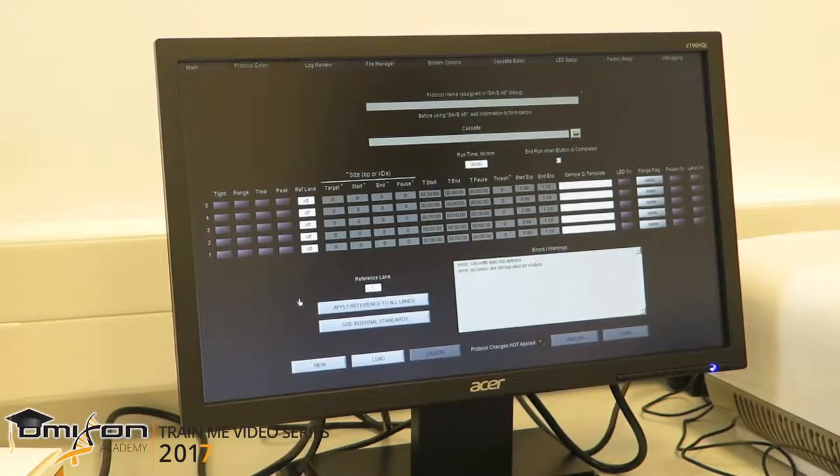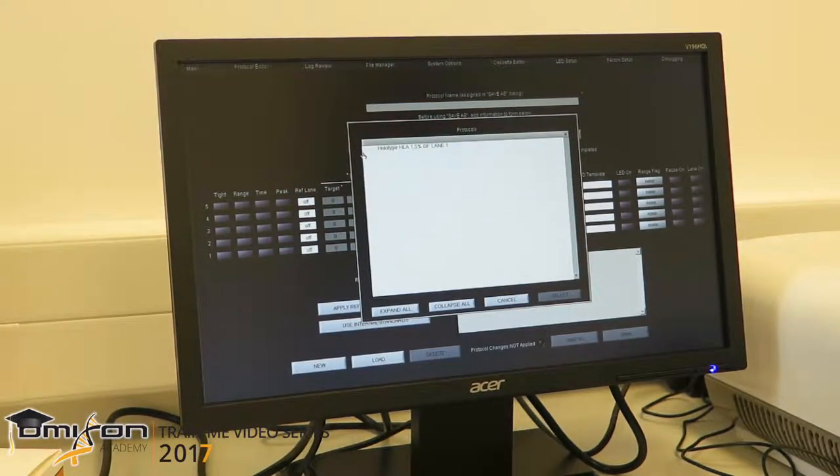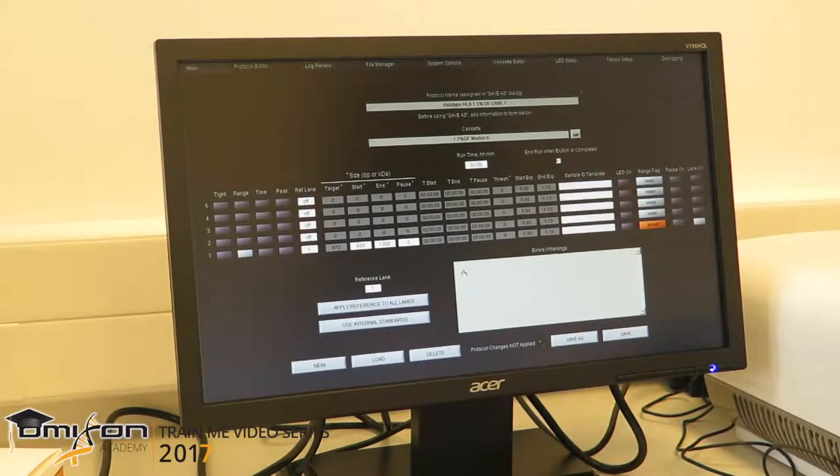In order to set up the protocol, all we have to do is click the Load button where we have saved our default protocols. We click on the protocol that we are using — we always name them HoloType HLA so we know what we are using. We will only be using lane 1, so this is the only thing that we need. We click select, and all of the necessary information is imported. We will start collecting from 650 base pairs to 1300 base pairs.